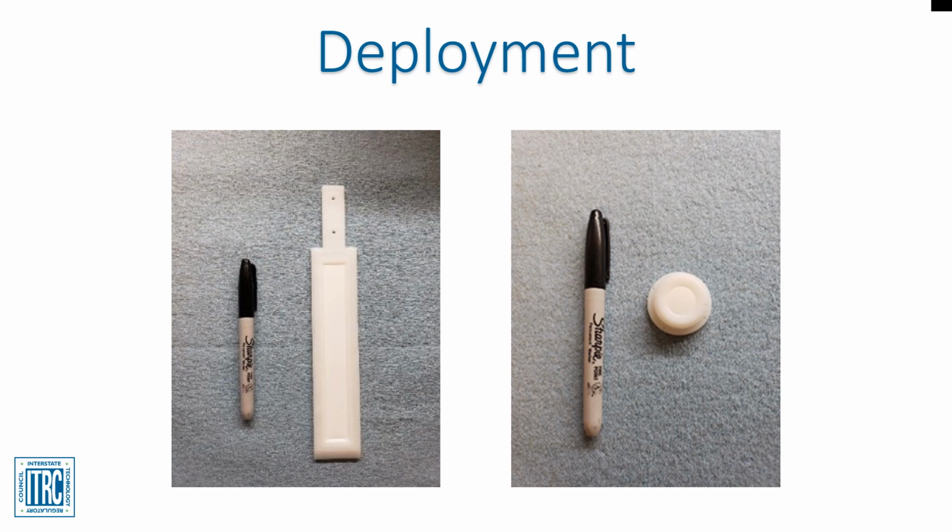The DGT deployment time should be carefully determined and consider the following factors. Deployment time should be sufficiently long enough to accumulate target chemicals in the binding gel, but short enough to avoid the saturation of the binding gel. The sampler should be deployed as soon as possible after taking out from oxygen barrier bags to minimize the introduction of oxygen into the device. Deployment duration, temperature, pH, and salinity of the aqueous media are recorded by field personnel during both deployment and retrieval.